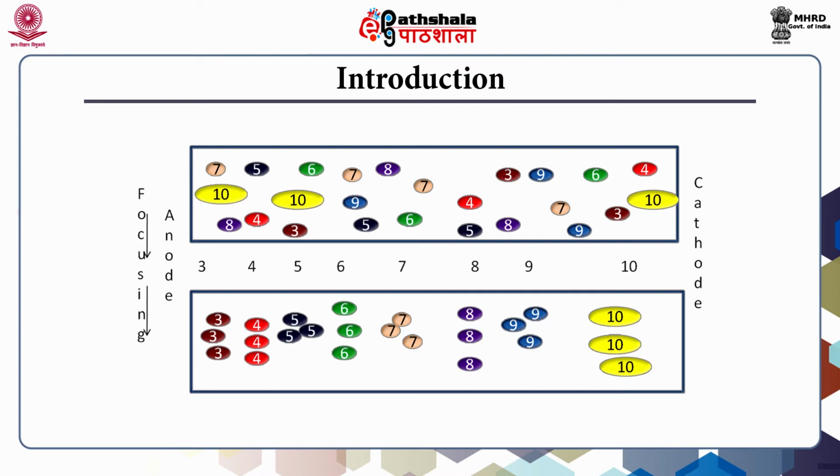While it is moving towards anode, protein will come in the vicinity of gel having lower pH. At this decreased pH, net negative charge on protein will decrease and this will result in lower migration rate. Thus, in pH gradient, the rate of migration of protein will continuously decrease and protein will not move further when net charge on the protein becomes 0.